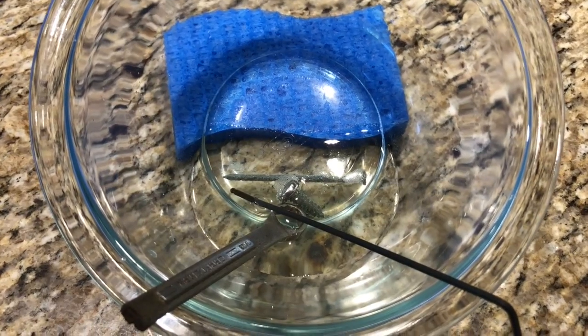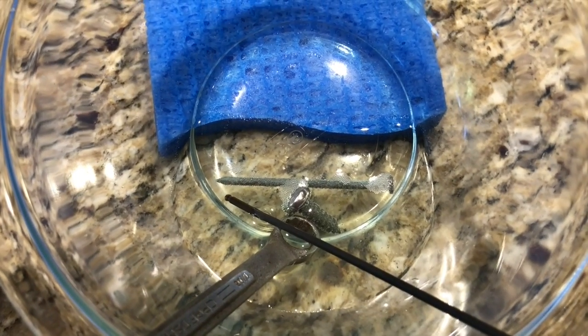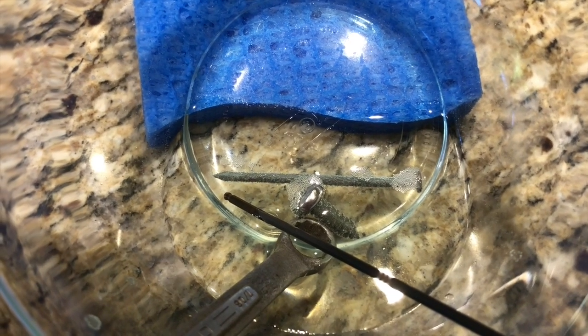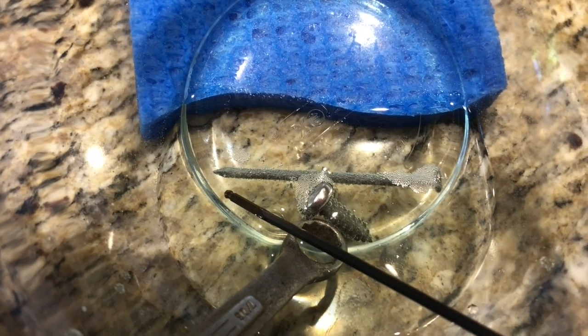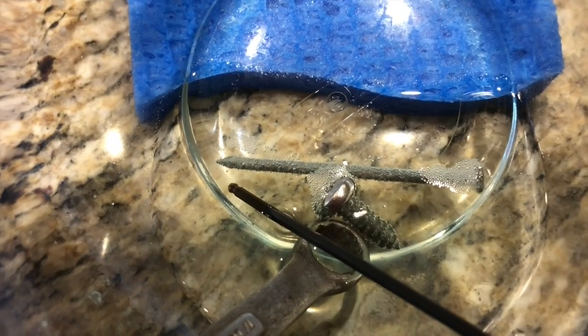The stainless steel screws I used in this experiment didn't get copper plated even after an extra hour in the solution. This is likely because the lab called for pure steel nails or screws composed mainly of iron, which I was unable to find. Thankfully, I was able to test some other metal objects I found in the garage to much greater results.